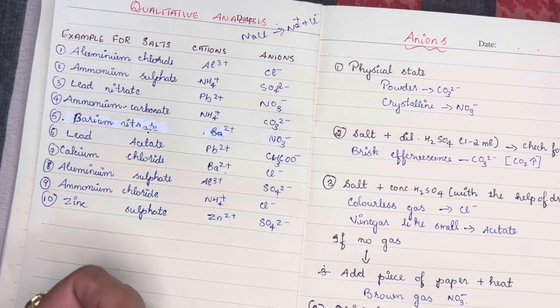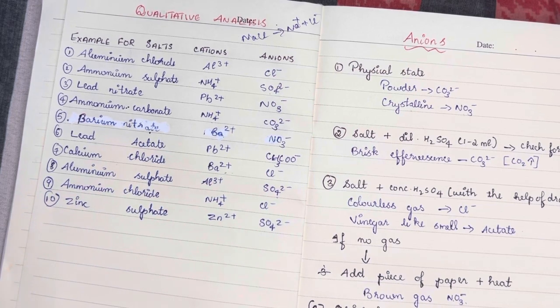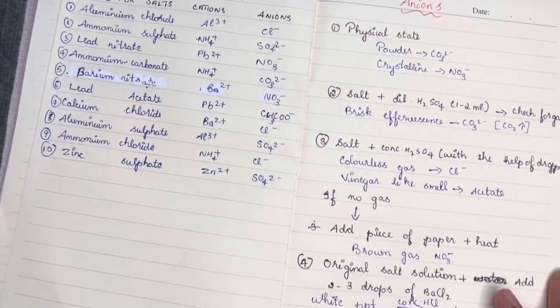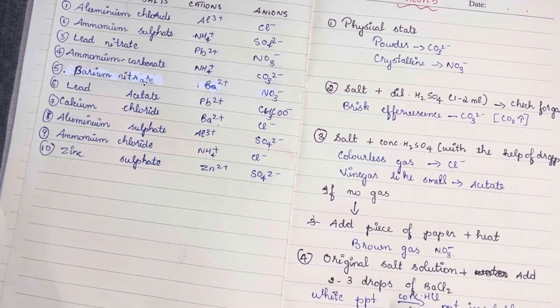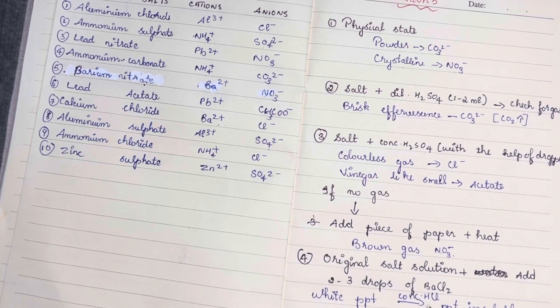After that, you have to take the salt and add water to it. This is known as the original salt solution or the OS solution. To this OS solution, add 2 to 3 drops of barium chloride. As we add barium chloride to the salt solution, there will be formation of a white precipitate. When we add concentrated HCl to this white precipitate, it will be insoluble.